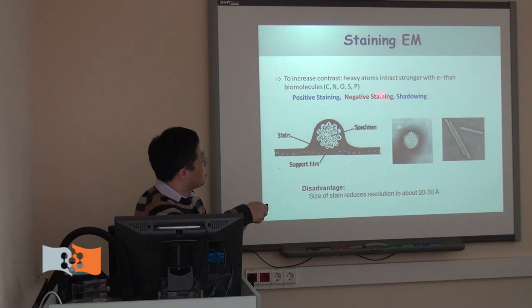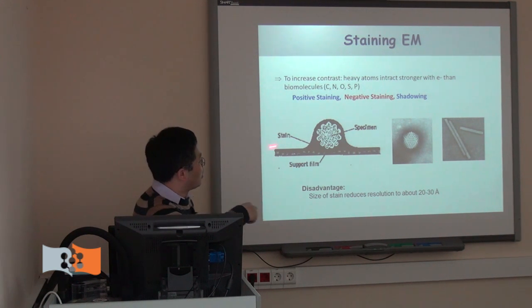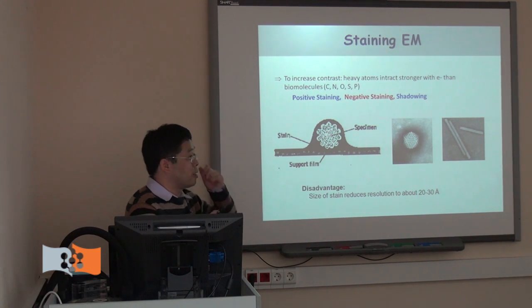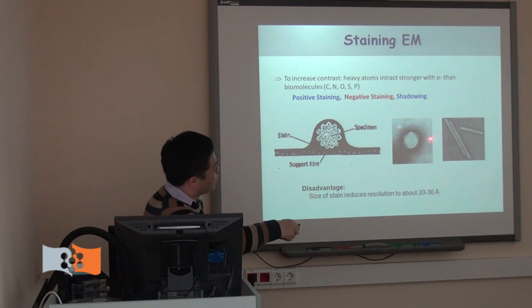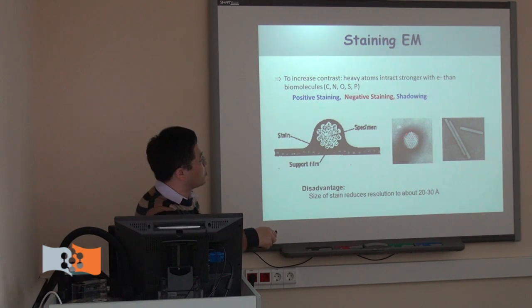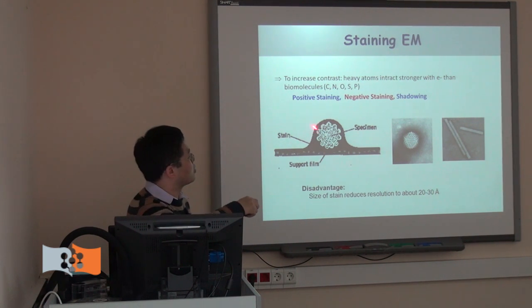What we mostly use is negative staining, where we spray a layer of heavy atoms, mostly tungstate or similar. In the background you see black, because the heavy atoms do not let the beam through, but the molecules appear white. That's what we call negative staining. Sometimes we also make a shadowing of heavy metal on the surface to give contrast.